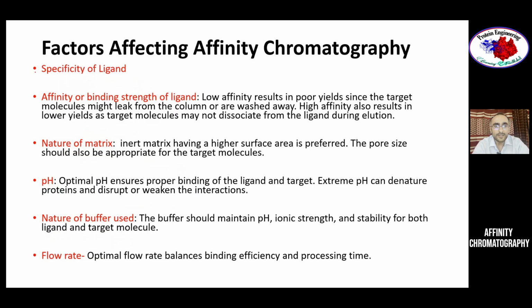The factors affecting affinity chromatography: first is the specificity of the ligand. So that is of prime importance. You must have a ligand which is highly specific. Only then you can use it. Otherwise, you cannot use affinity chromatography.